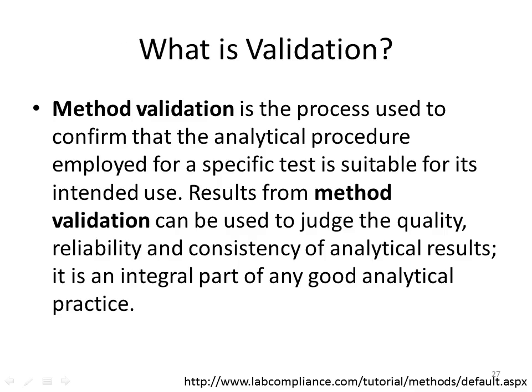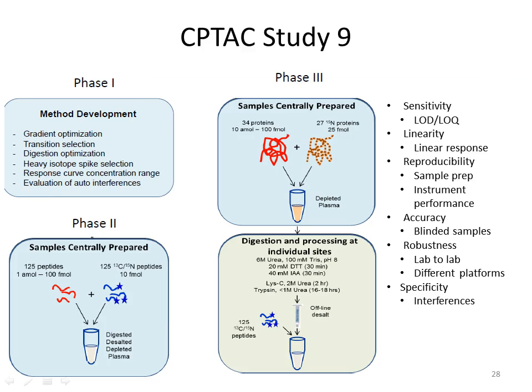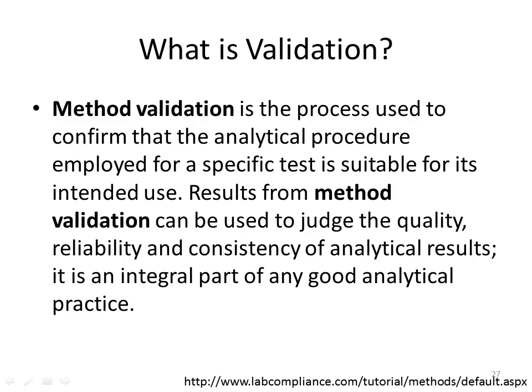So what is validation? This is the next step. So we kind of inadvertently validated our CPTAC method because we wanted to set it up correctly to make sure that it was top quality experimental design. And looking back in hindsight, I now see, oh, we actually kind of validated some of these things.